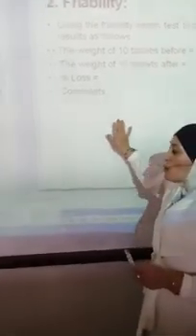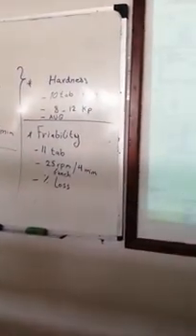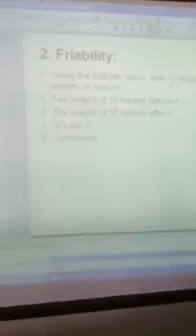The percentage loss must be less than 1%. This is also an official test. The third test, which is the disintegration test.